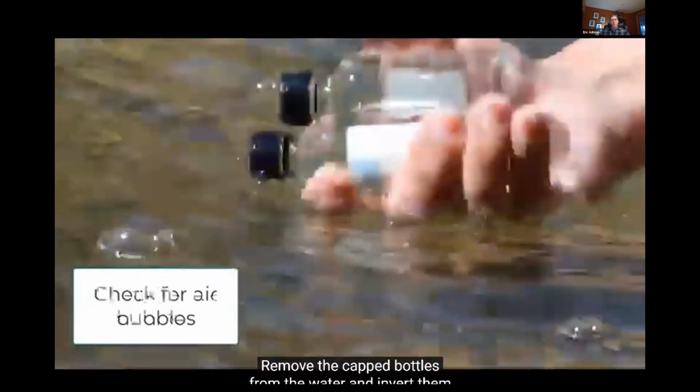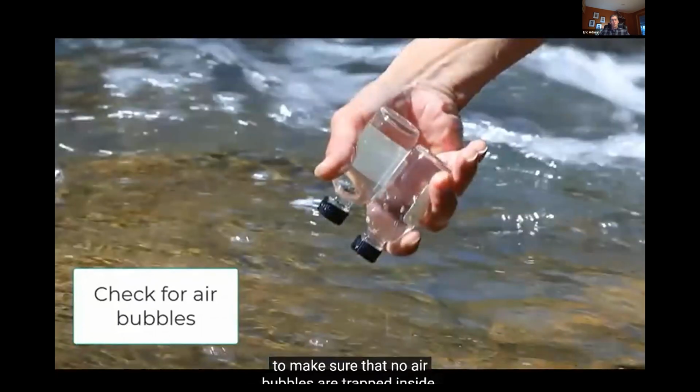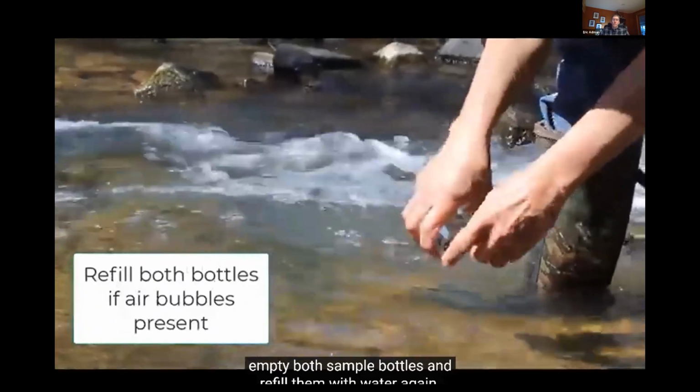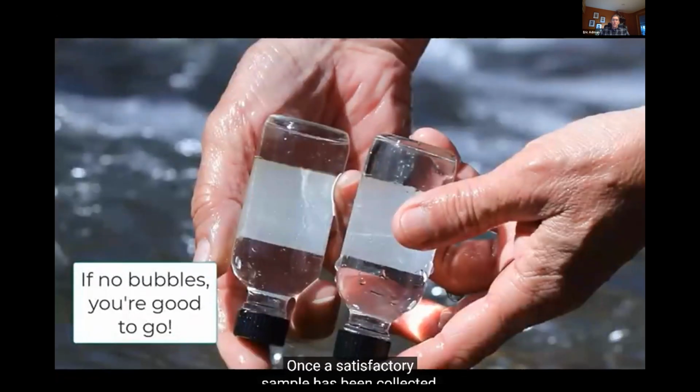Remove the capped bottles from the water and invert them to make sure that no air bubbles are trapped inside. If air bubbles are present, even if they're only in one bottle, empty both sample bottles and refill them with water again. Once a satisfactory sample has been collected, proceed immediately with the next steps.